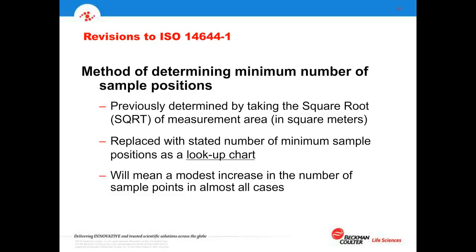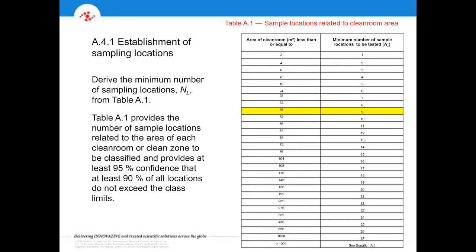So with the help of some consultants in statistics, one from Denmark, one from Japan, another from the U.S., it was determined that we needed to increase that, and we really needed something more like a chart in order to carry out that improvement in the statistical reliability.